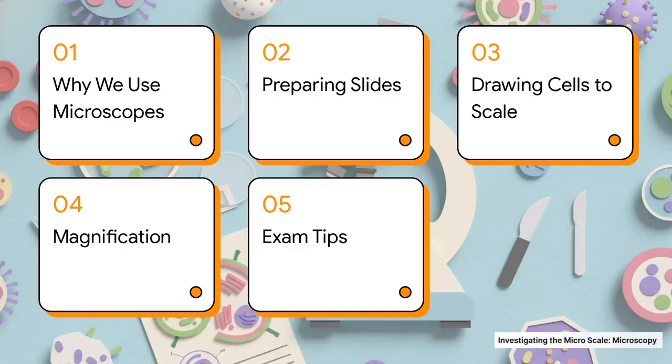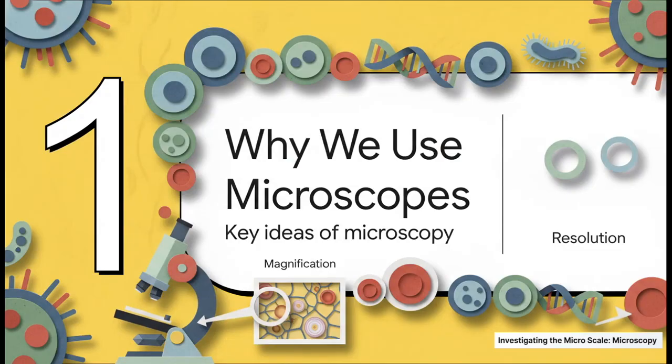So here's our game plan. First, we'll look at why we even use microscopes. Then we'll get practical, covering how to prepare slides and get a perfect focus. After that, we'll dive into scientific drawings and magnification maths, and we'll wrap it all up with some top exam tips. Right then, Section 1, why do we bother with microscopes?